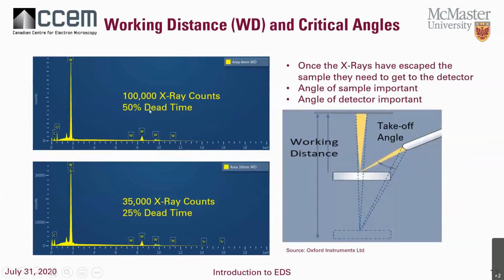I'm going to talk about dead time in a moment. We'll talk about a few factors first. Once the X-rays have escaped the sample, they need to get to the detector. So you have the detector up here. There's a particular takeoff angle that it's set to.